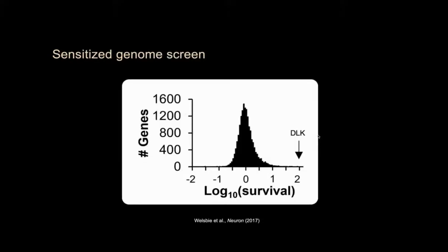So we did. We've actually done this now in multiple screens. But shown here are the results of screening approximately 18,000 siRNAs. And these are little mini pools of 4 siRNAs per well. It was satisfying that the well that contains the mini pool against DLK was actually the number 1 hit. So the screen in general was working to identify things in the DLK pathway because it identified DLK. But when we went to confirm the other genes that were increasing survival by ordering new siRNAs against those, we really found almost nothing was confirming.